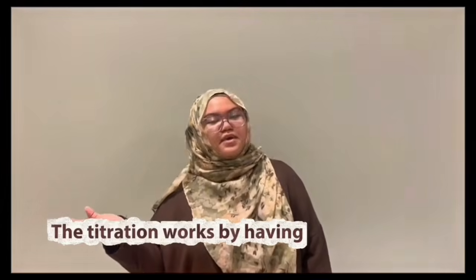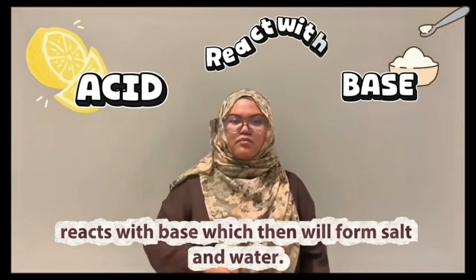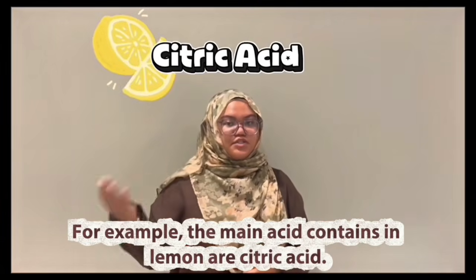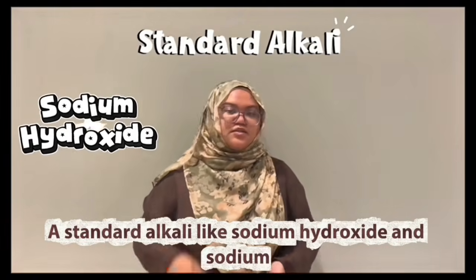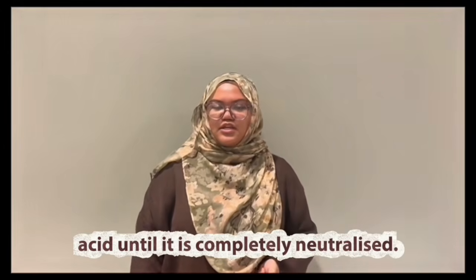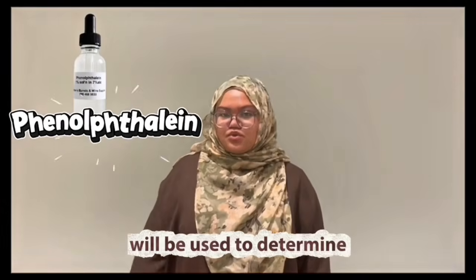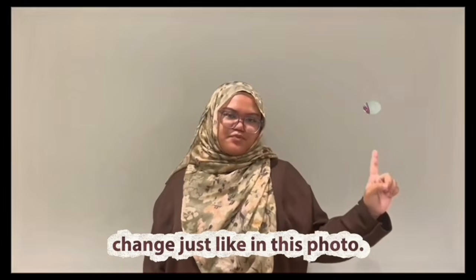The titration works by having acid from the fruit react with the base, which then will form salt and water. For example, the main acid contained in lemon is citric acid. A standard alkali like sodium hydroxide and sodium bicarbonate will be added gradually into citric acid until it is completely neutralized. In a normal titration, indicators such as phenolphthalein will be used to determine the end point when the color of the solution changes, just like in this photo.